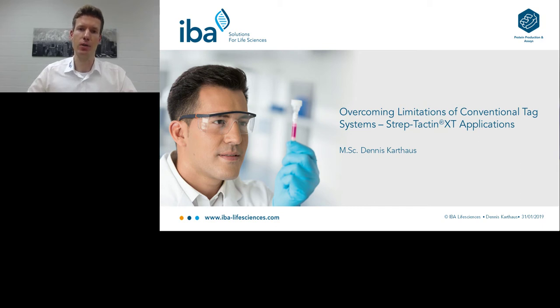On the other side, when you look to purification, and especially if you want to purify your protein under physiological native conditions, a binding affinity that high will make it impossible to elute your protein efficiently from the column. So therefore, you have to find a compromise which allows you to elute your protein from the column, but on the other side, immobilize the protein on chips. And yeah, that's a kind of impossibility.